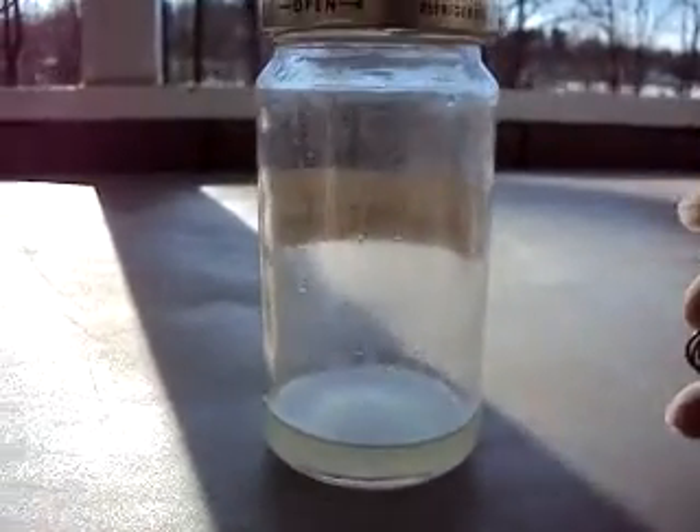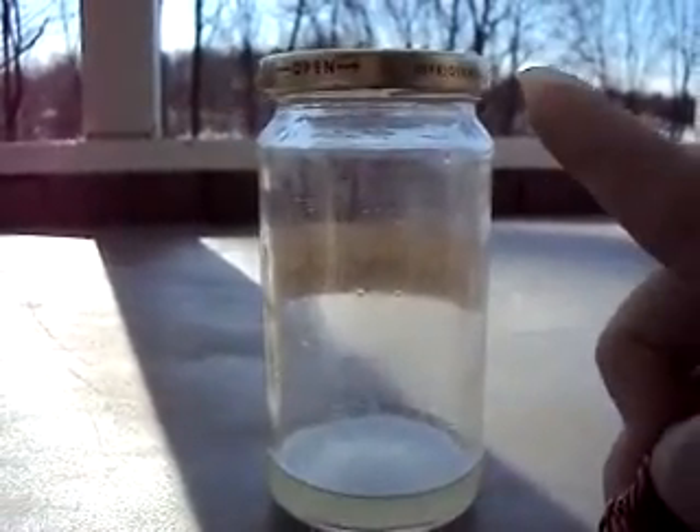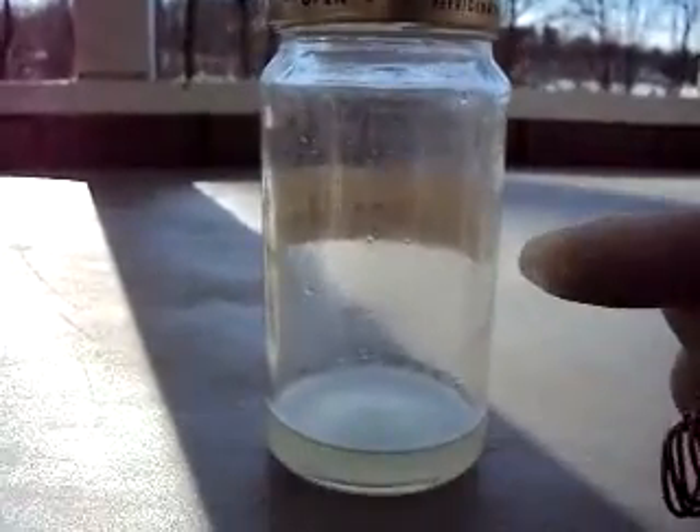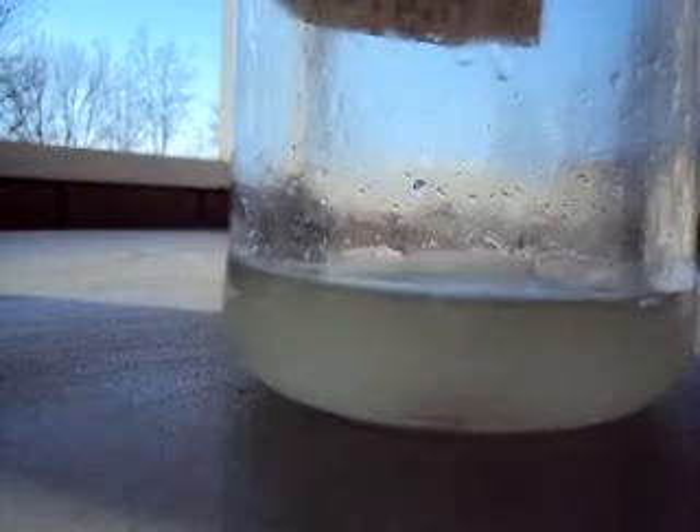I'm going to get the top off, drop in the copper, and leave the cap unscrewed so that too much pressure doesn't build up in this jar. Drop the copper in and put the top on. You can already see a slight reaction — and there it goes. So far I don't see any red fumes evolving. The reaction seems to be a bit faster than normal.